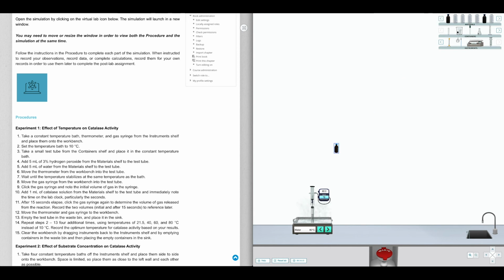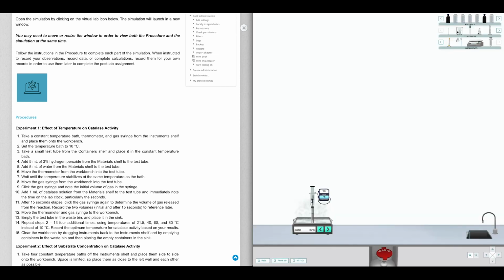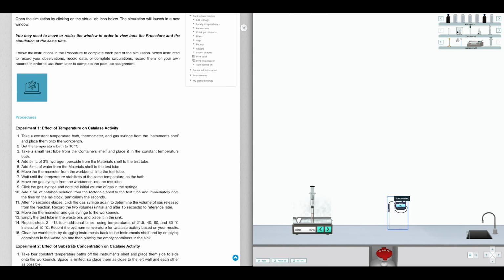1 ml, go. We're at 20, so we'll go to 35. Ready, go. 56.84 milliliters. Done. So now we're done with that particular part of performing the experiment. What we want to do now is compile all of our data. And if you've been writing this down, you should have something that looks like the following.